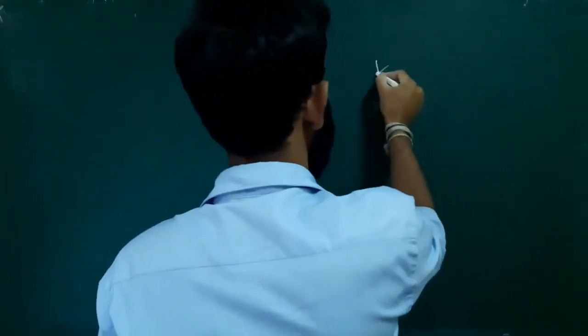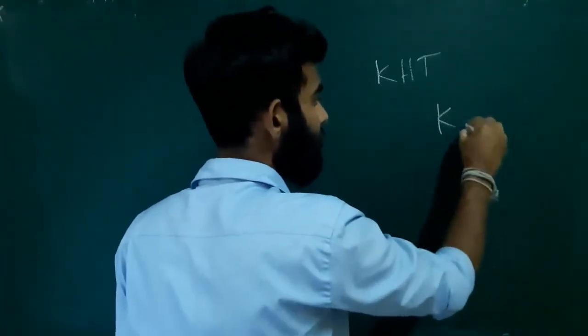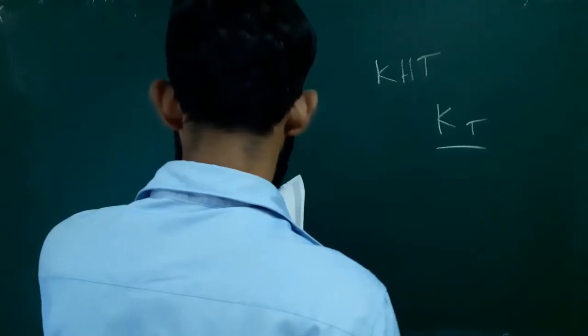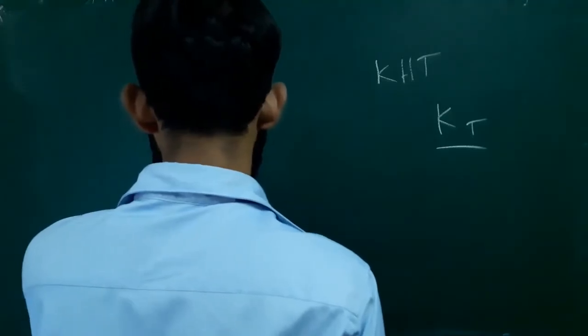Okay, next experiment is determination of the thermodynamic solubility product of potassium hydrogen tartrate, KHT. Okay, so we are going to find out the thermodynamic solubility product of potassium hydrogen tartrate.